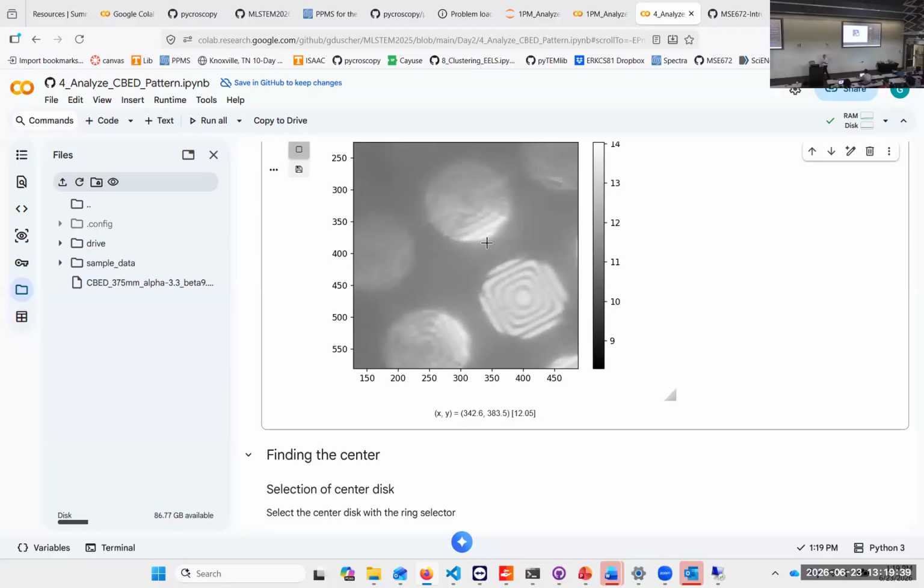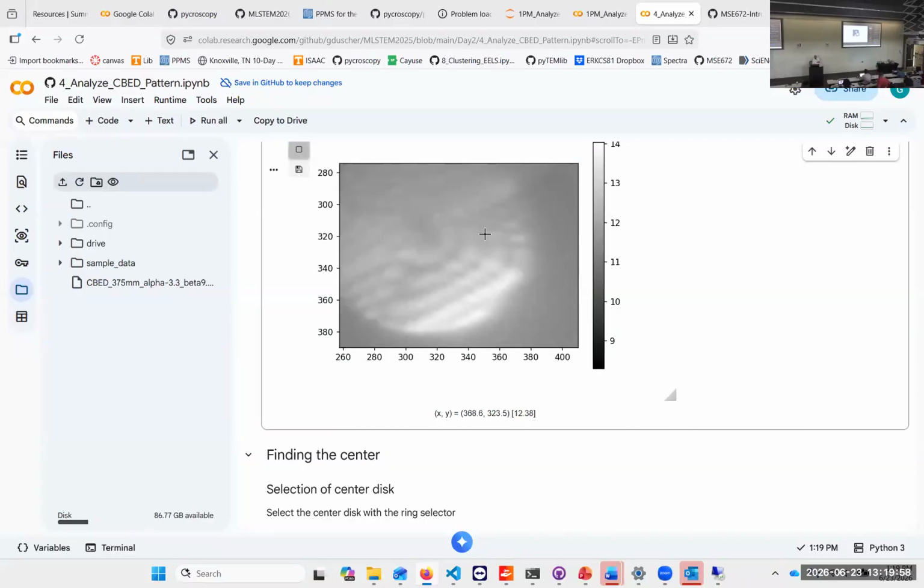Very nicely, you can see the changes, not of the symmetry, but of the feature frequency in the different orientations, right? So we see this spot pattern that we saw earlier, but the frequencies in the different orientations are very, very different in this diffracted disk.